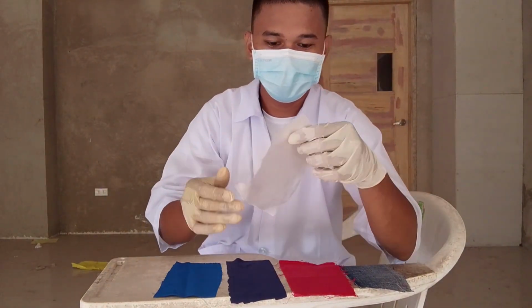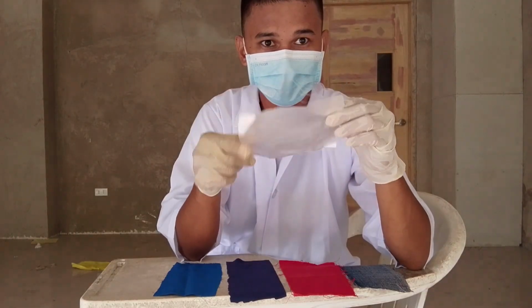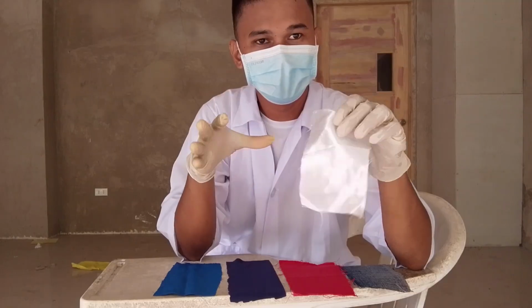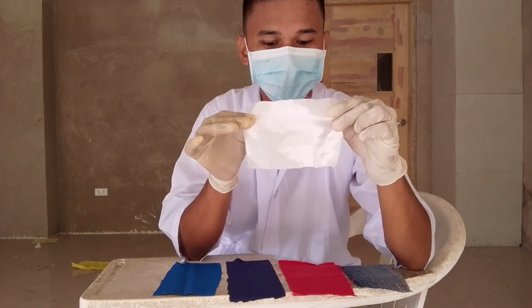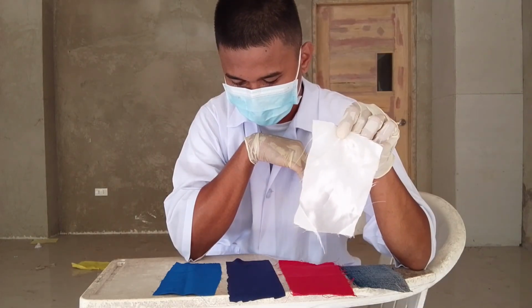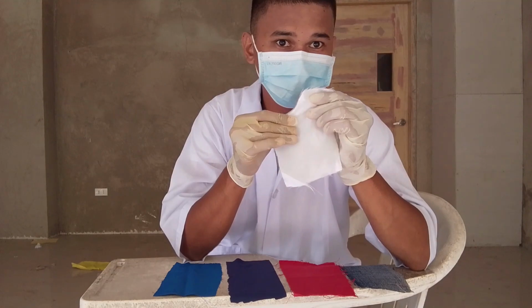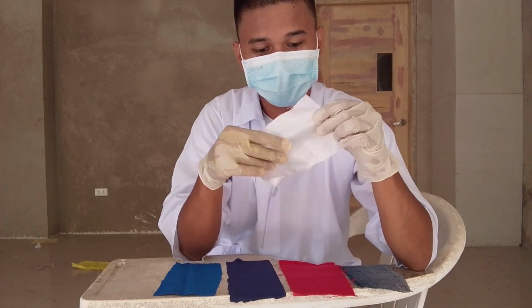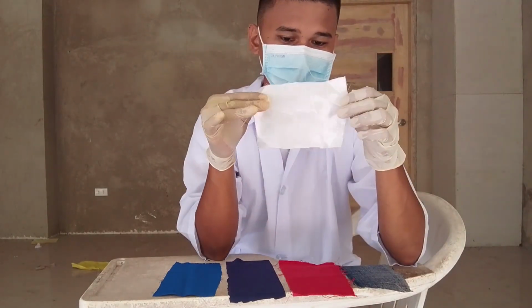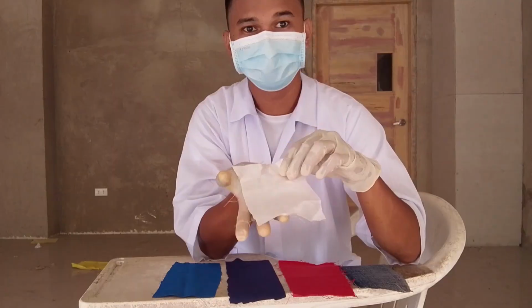And lastly is the silk. Silk is commonly used as dresses and designs in the house. It is also used as designs in curtains. And the color of the silk I use is white. The texture is soft and slidey, and the shape of the silk I use is also a rectangle and a size of 4 by 5 inches.